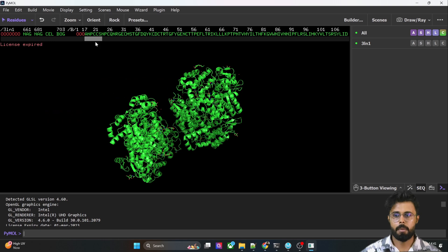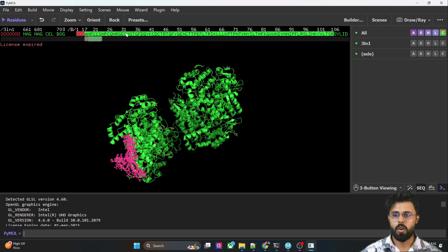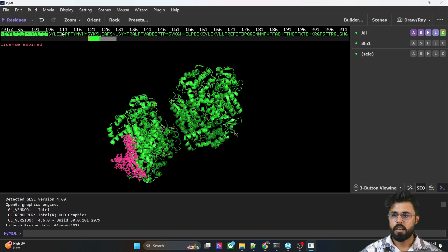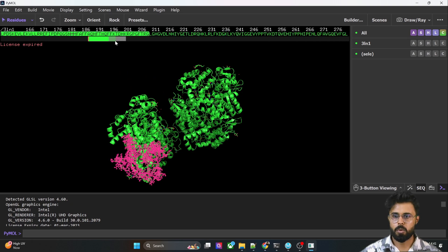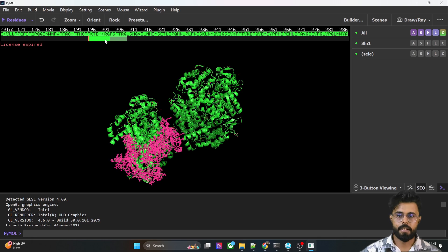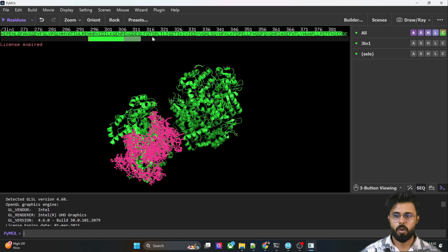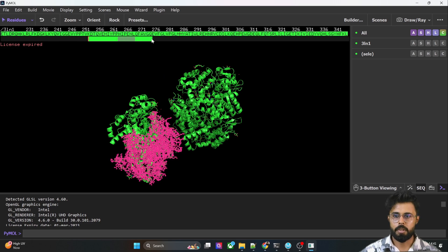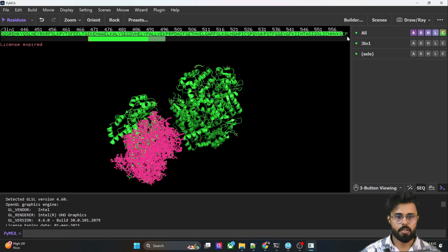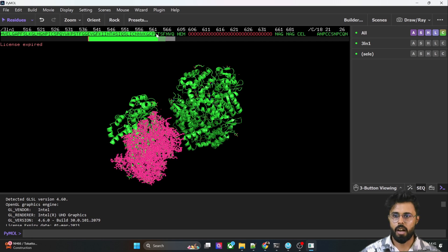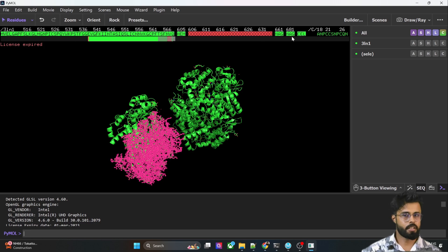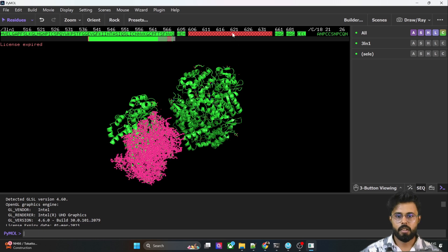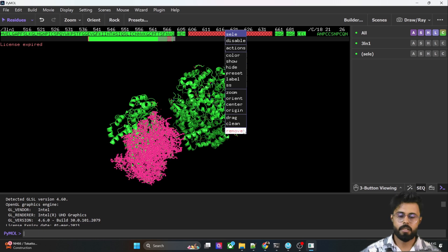We are taking the A chain. We can select all the amino acid residues corresponding to B chain by selecting like this — select the whole amino acids corresponding to B chain. Don't miss anything; this is a large, long structure. I've selected all the amino acid residues in the B chain, and you can directly delete them.